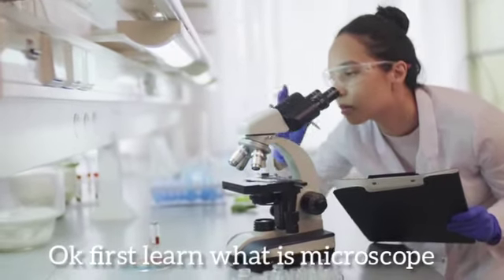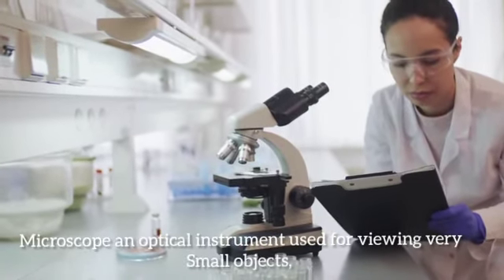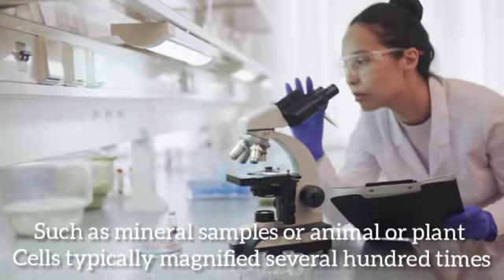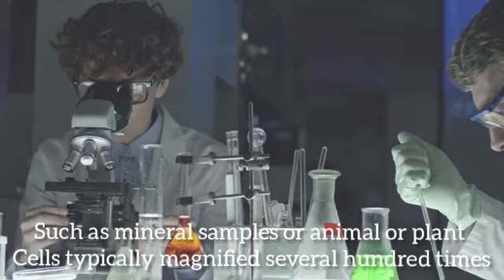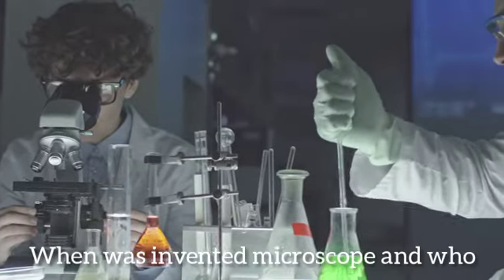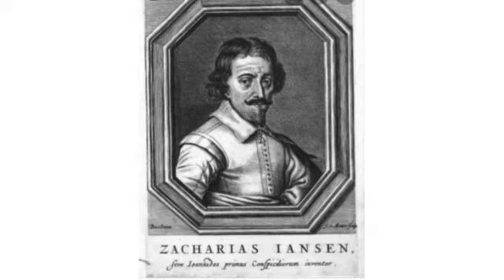Okay, first learn what is a microscope. A microscope is an optical instrument used for viewing very small objects, such as mineral samples or animal or plant cells, typically magnified several hundred times. When was the microscope invented and by whom? The microscope was invented in 1590 and the inventor was Zacharias Janssen.